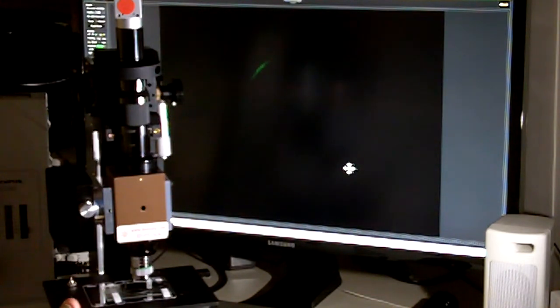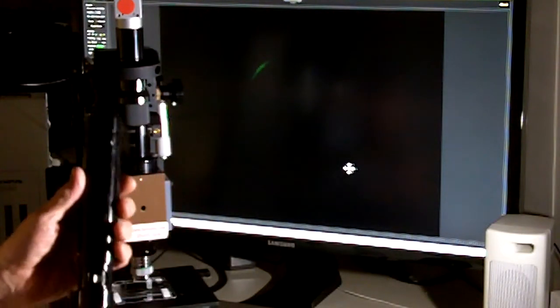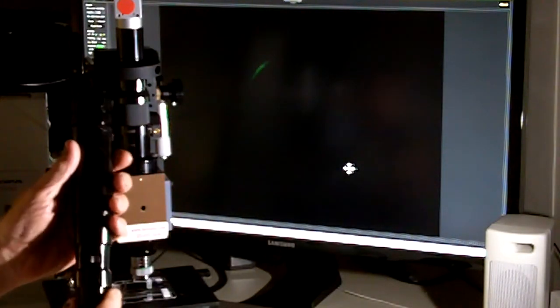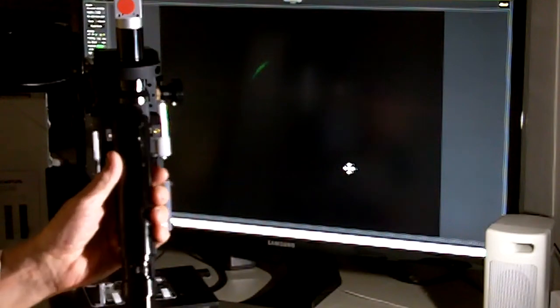And it's a complete research microscope with built-in transmitted light. And typically a microscope is included with the base system. It's a very nice macro zoom.